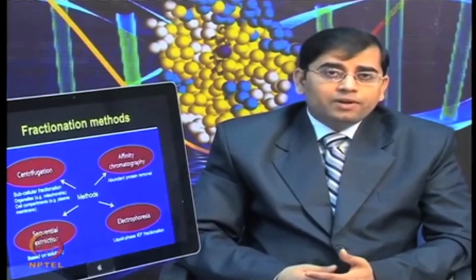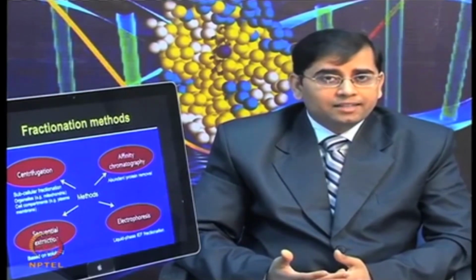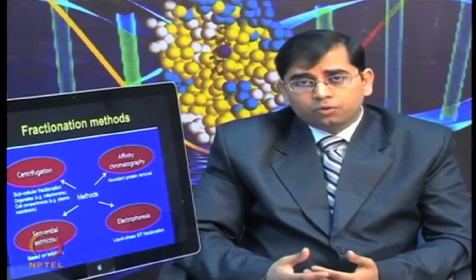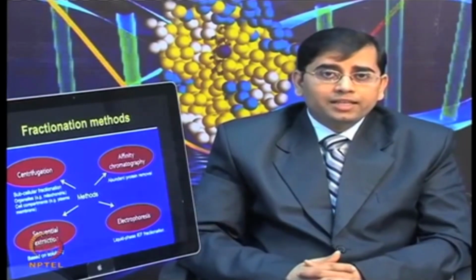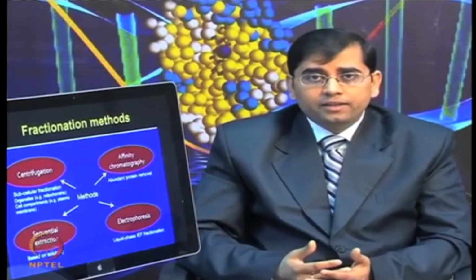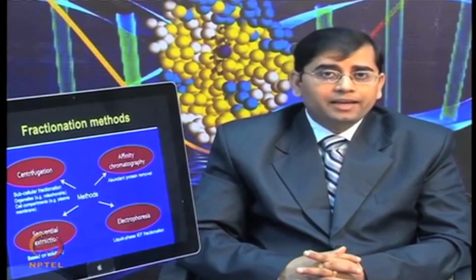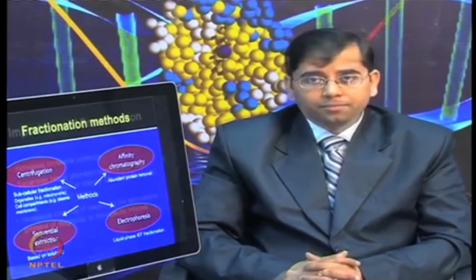In the next lectures, when I talk about specific gel-based and gel-free techniques, I will describe a newer method being used, off-gel fractionation, which simplifies this step of separating proteins based on their isoelectric point in liquid phase. One can collect the fractions of different pI ranges and then further perform the proteomic analysis.